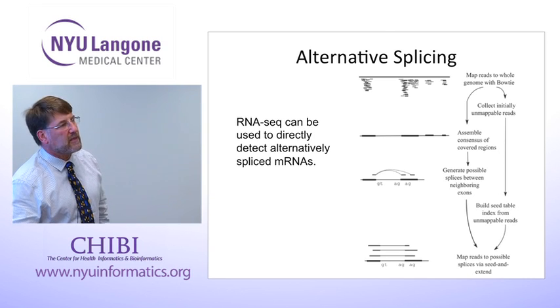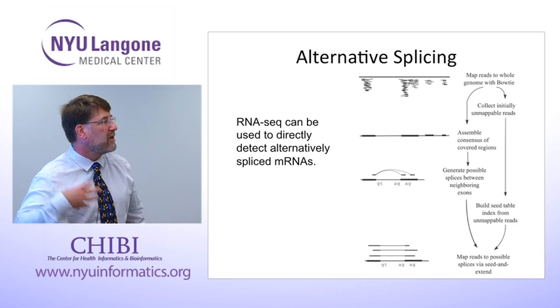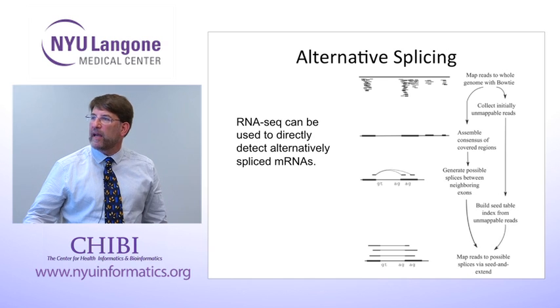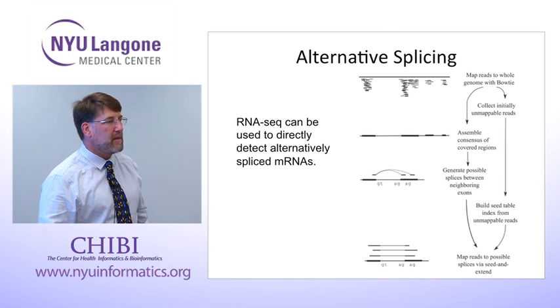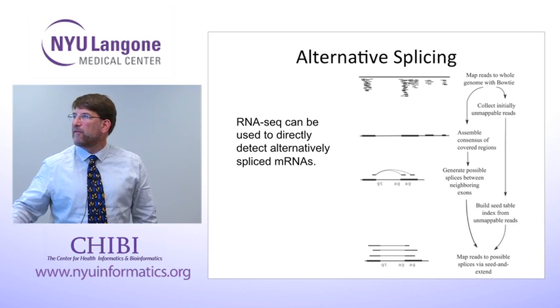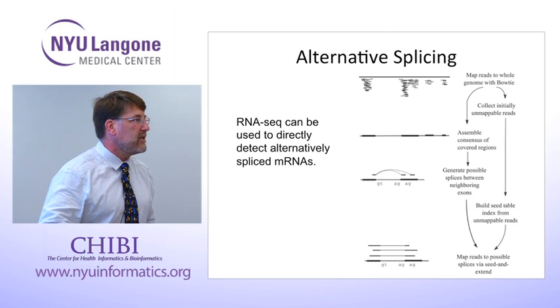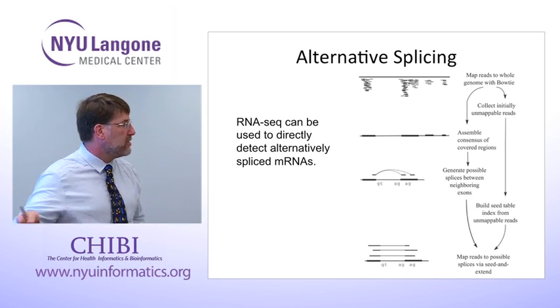And this is really interesting because whenever you look at RNA-seq data, you can always see some stuff that doesn't agree with the genome annotation that we're using, especially if we use a really conservative one like RefSeq. There's always extra exons. There's always expression up here that wasn't previously included in the 5' end of the gene. And we could use this kind of a method. This is, again, the Top Hat software to find new exons and new transcripts. And so, again, if you're interested in a finite number of genes, we could do this. We can do it with reasonable certainty genome-wide.